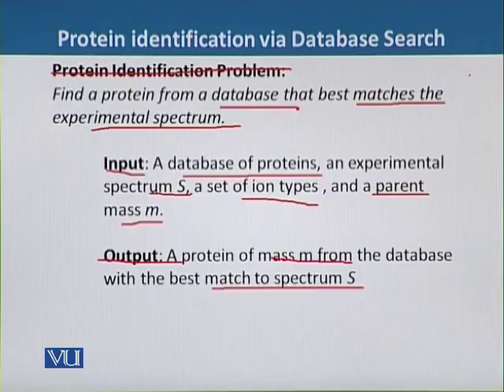So it will be much easier to find the sequence of the protein by using the spectra generated by MS and comparing it with the sequences that are already present in the databases of proteins.